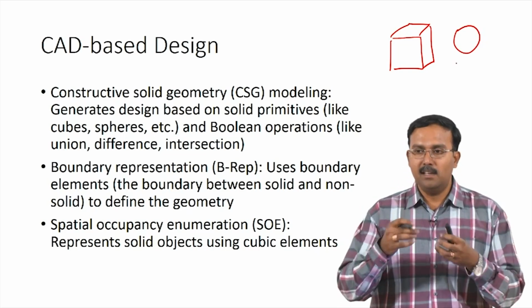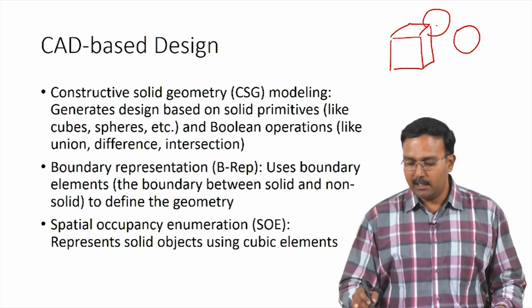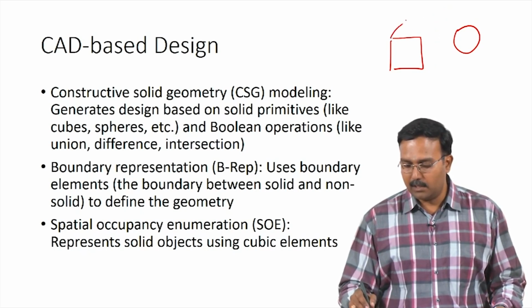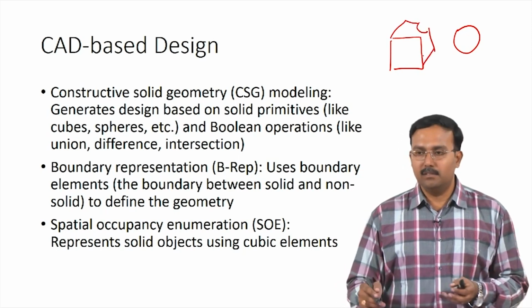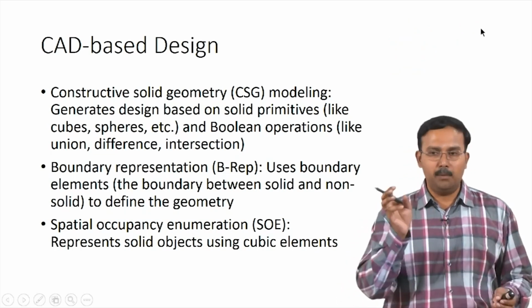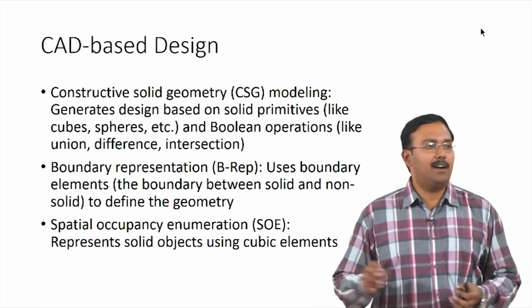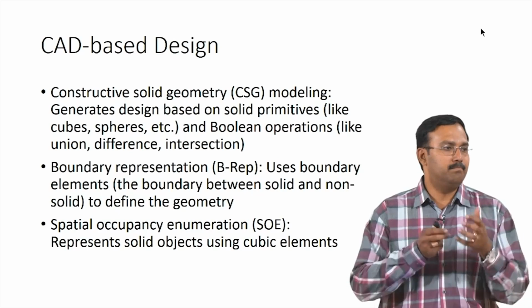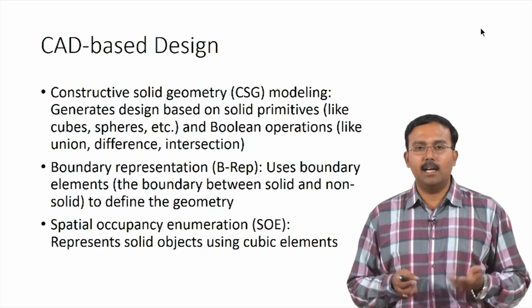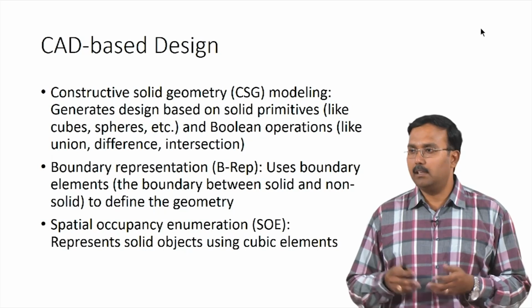You can add these and you would get something which basically has a sphere here, or you could subtract this and delete this and you will end up having something like this, where you have this as the structure, right. It is possible to do either of this, and you can also have an intersection which will only be a portion of the sphere and so on. This is just for a sphere and cube. You could have other solid primitives and bring combinations thereof using Boolean operations to get different internal architectures, which can closely resemble what you would see in a real tissue.